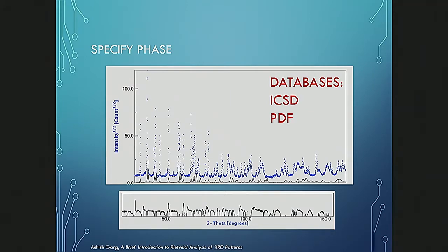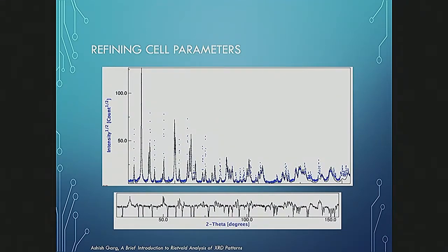And now we can get this fitting value. Our goal is to match the fitting to the experiment. We first adjust the overall intensity. And the Le Bail fitting is mainly about the unit cell. After we choose the phase, we have fixed the space group, and now we want to refine the lattice constant to match the peak position. After that, we can see that the R value is still very large.